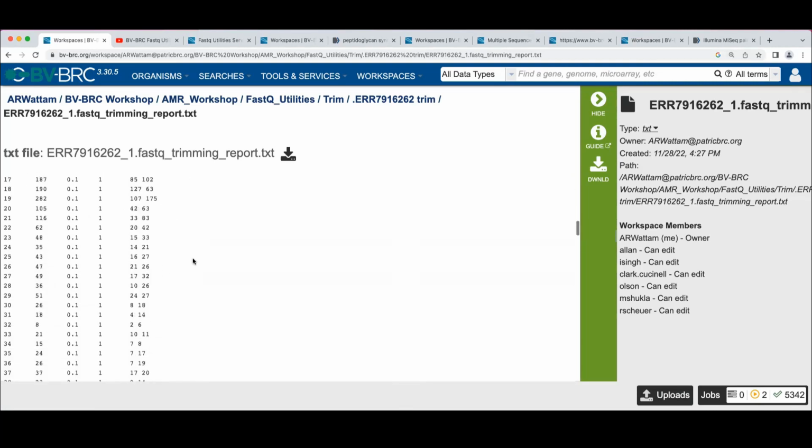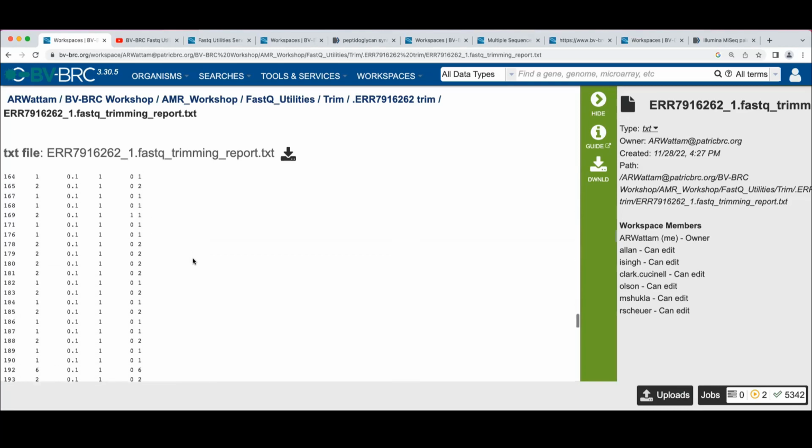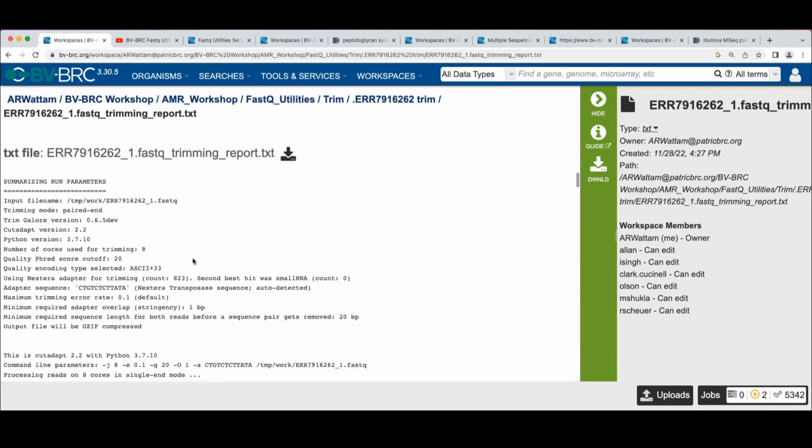And then it goes into all this stuff which I could care less about, but some people in the room, and I'm not going to name who they are, even though they're all sitting in the back row, generally they find this is the kind of stuff that lights their fire, but it doesn't do anything for me. So we include it for that type.